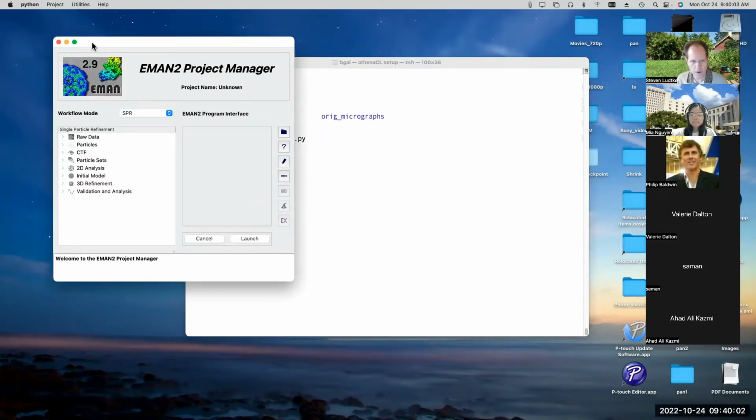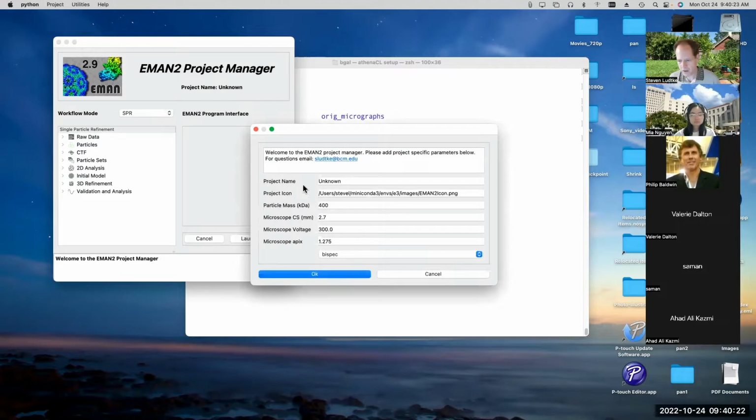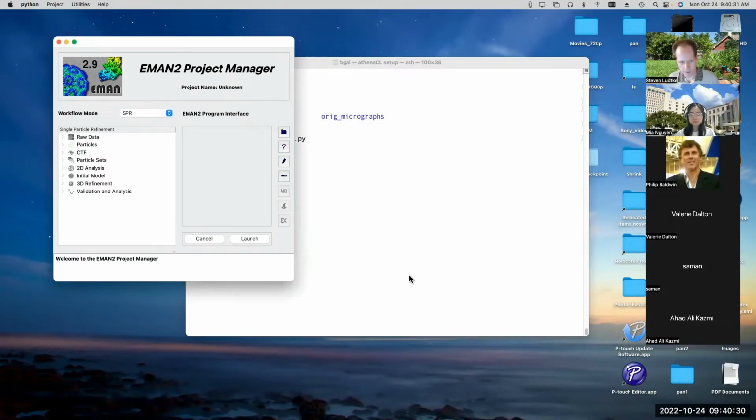Yeah, when you first open a GUI window like this, the menu bar won't work correctly. So you click on the menu bar, nothing will happen. But if you click away to another window and then click back, then it'll suddenly start working. It's been a problem that's part of the Qt system for many years now, and they just never fixed it. Anyway, if we edit project, you should see all the settings here are exactly what the tutorial tells you to fill in. So we don't actually have to do anything here.